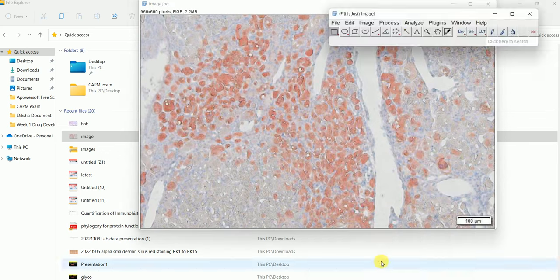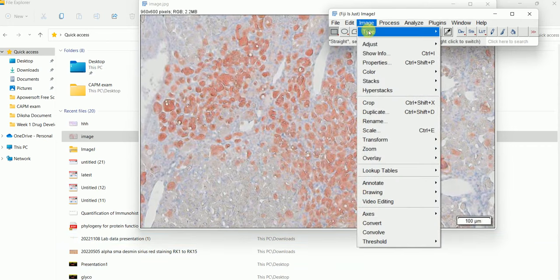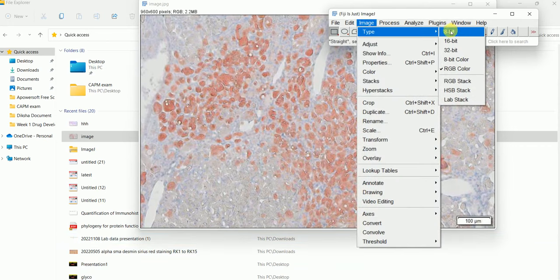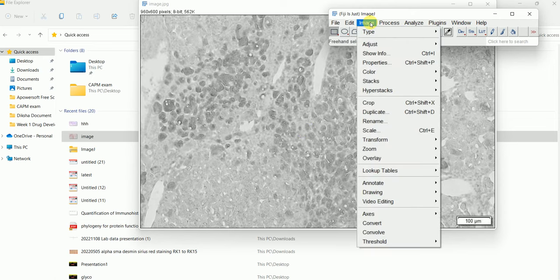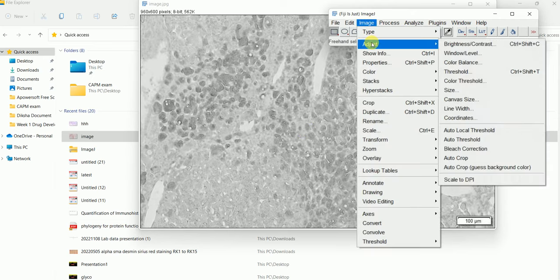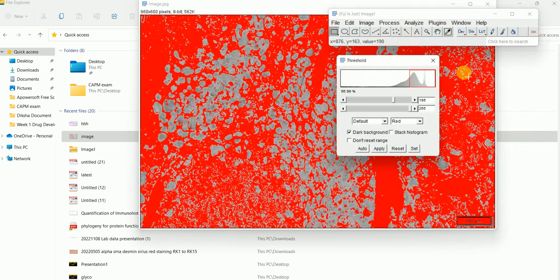To do so, go to Image, then go to Type and convert it to an 8-bit image. So: Image > Type > 8-bit. After this, go to Image again, then go to Adjust, then go to Threshold.